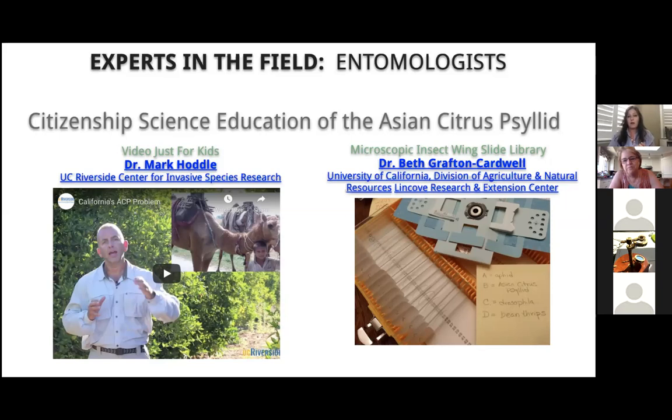One question I got a lot was about lesson plans. Foldscope did just recently come out with lesson plans, and I have read them. Even though they're geared toward middle school science, you could definitely get some ideas to go up or down in your grade level, or have it be a little simpler or a little more complex. I would definitely look at the Foldscope lesson plans.